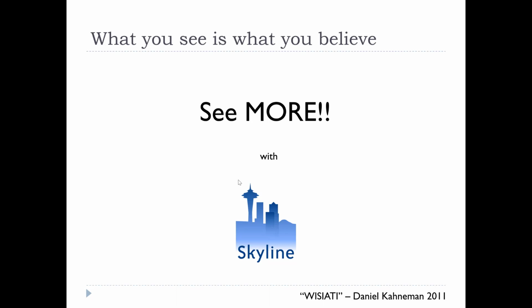And so I'm going to move into a session where I'm going to show you some plots and some things that, if you didn't have the tools, you'd just go right by. If you can't see what's going on with the data, then you're just going to go right by it. And so no matter what kind of experiment you are doing, I would argue mass spectrometry is really hard to see, and you would like to see more. And that's what Skyline's designed to do. It's designed to help you to see more.